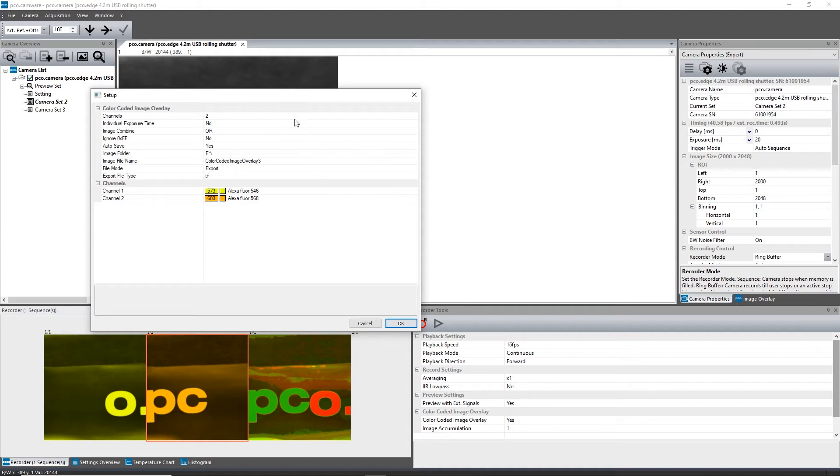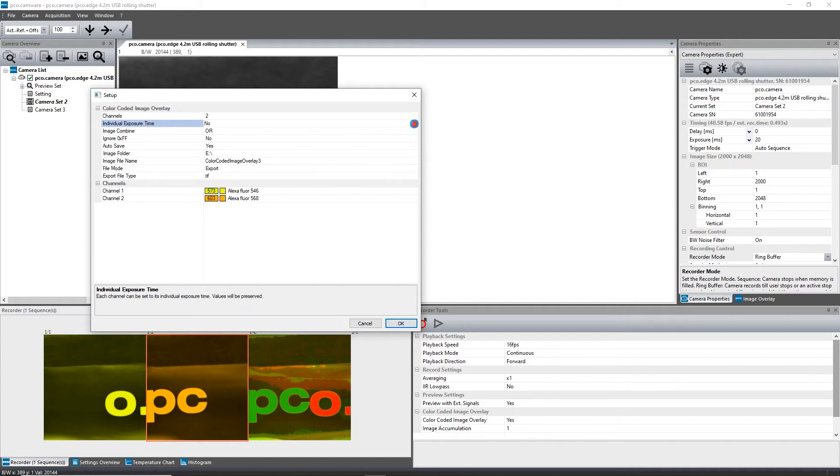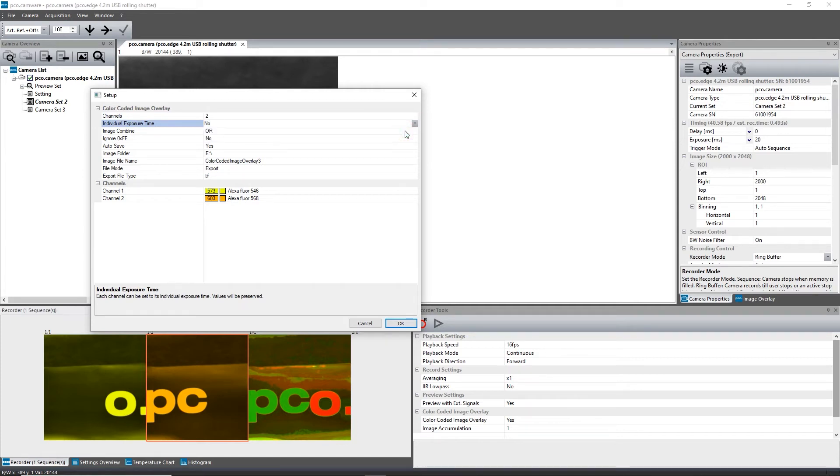In addition, the user can select the number of channels. Individual exposure times for each image can be enabled, and the automatic saving process can be defined.